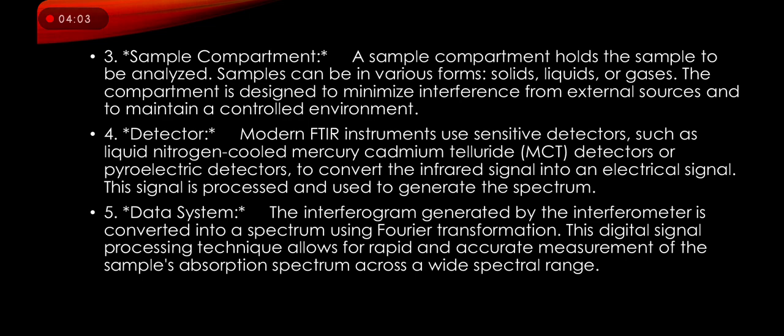Third is the sample compartment. A sample compartment holds the sample to be analyzed. The sample can be in various forms. It may be solid, liquid, or gas. The compartment is designed to minimize interference from external sources and to maintain a controlled environment.